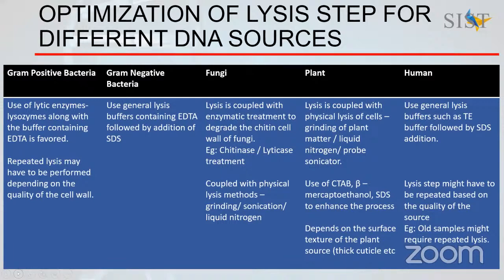And along with it, we can do physical lysis methods like grinding the tissue or grinding the fungus, and sonication methods where we use sound energy to disturb the cellular structure.